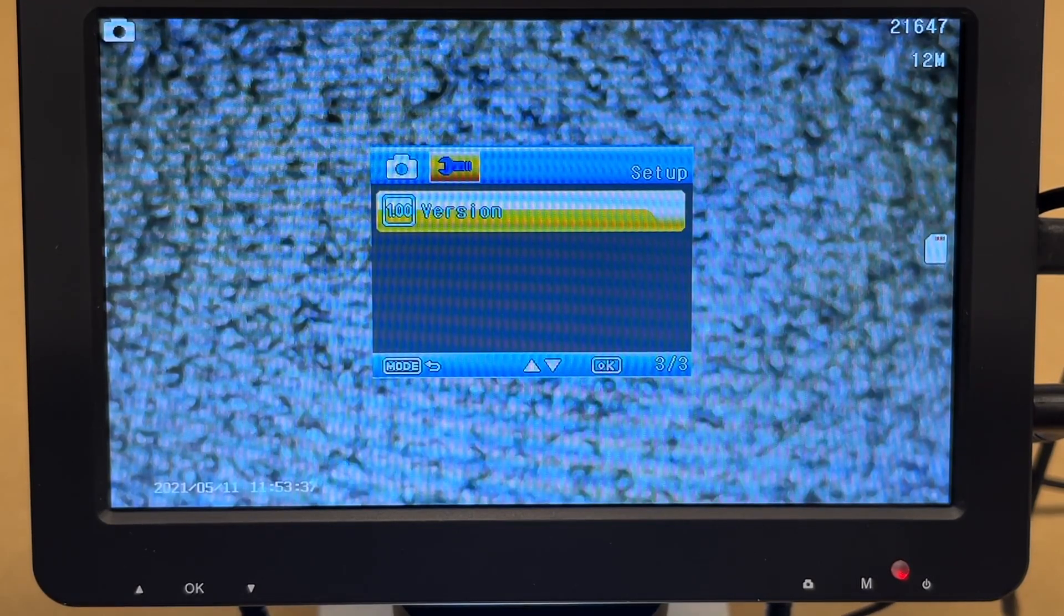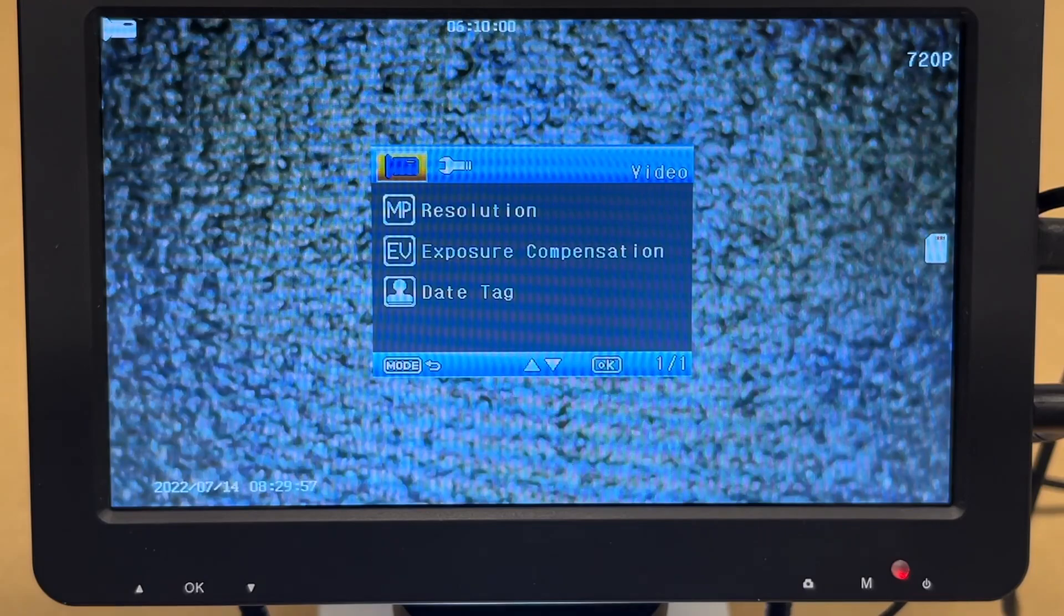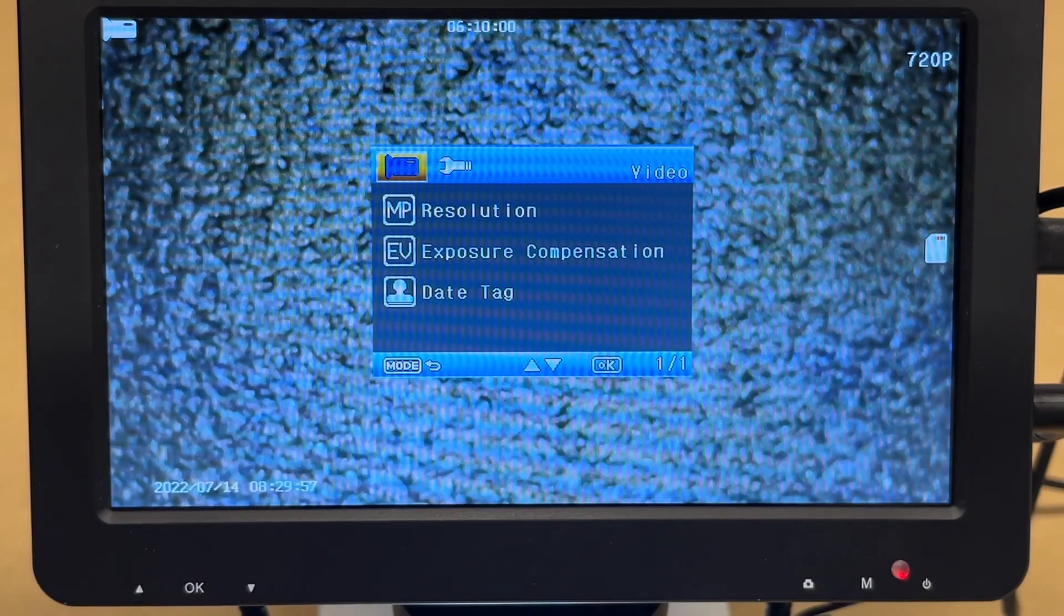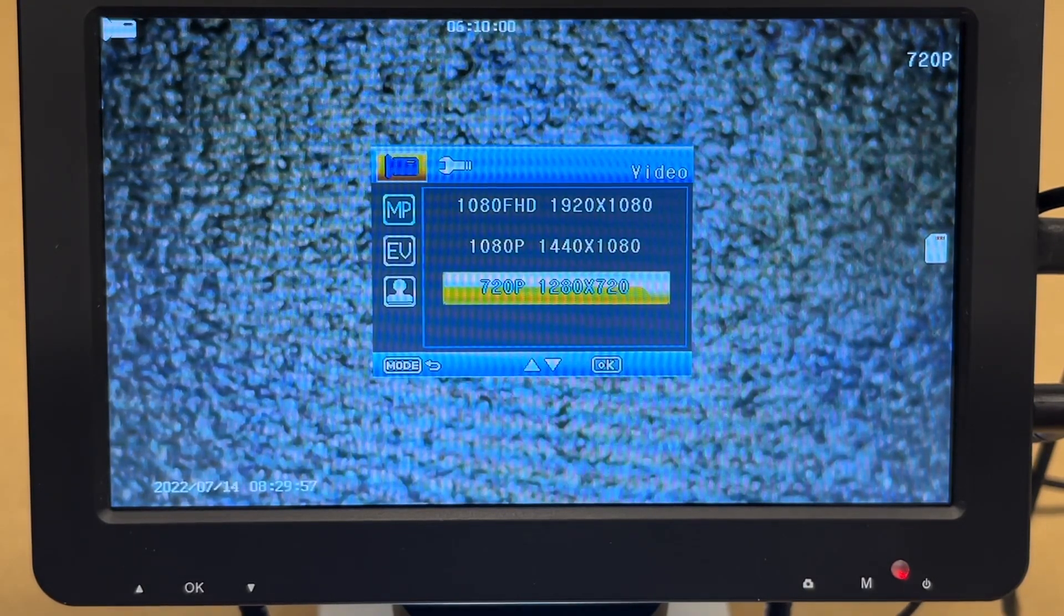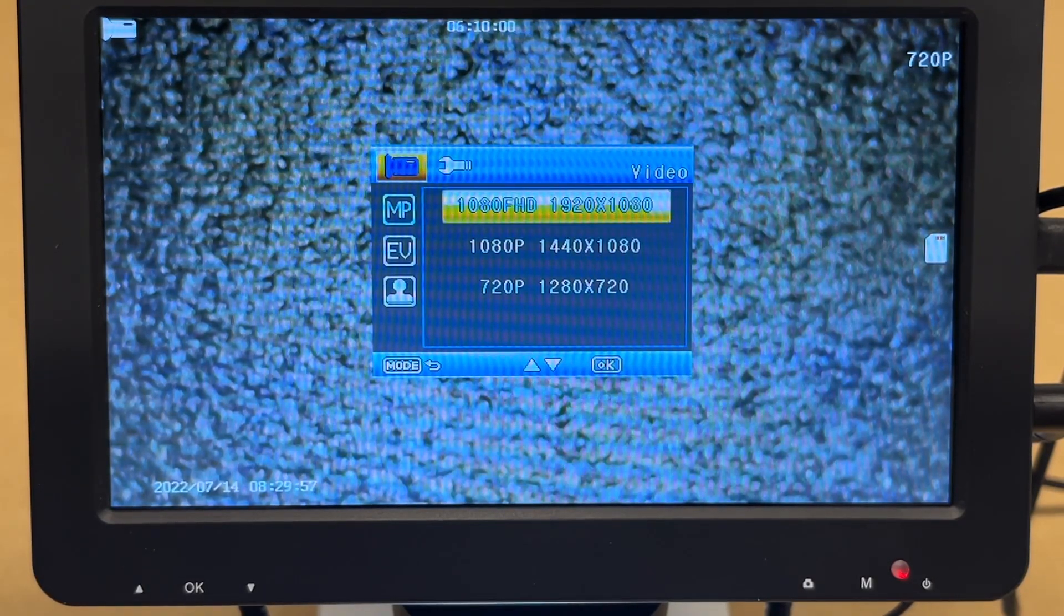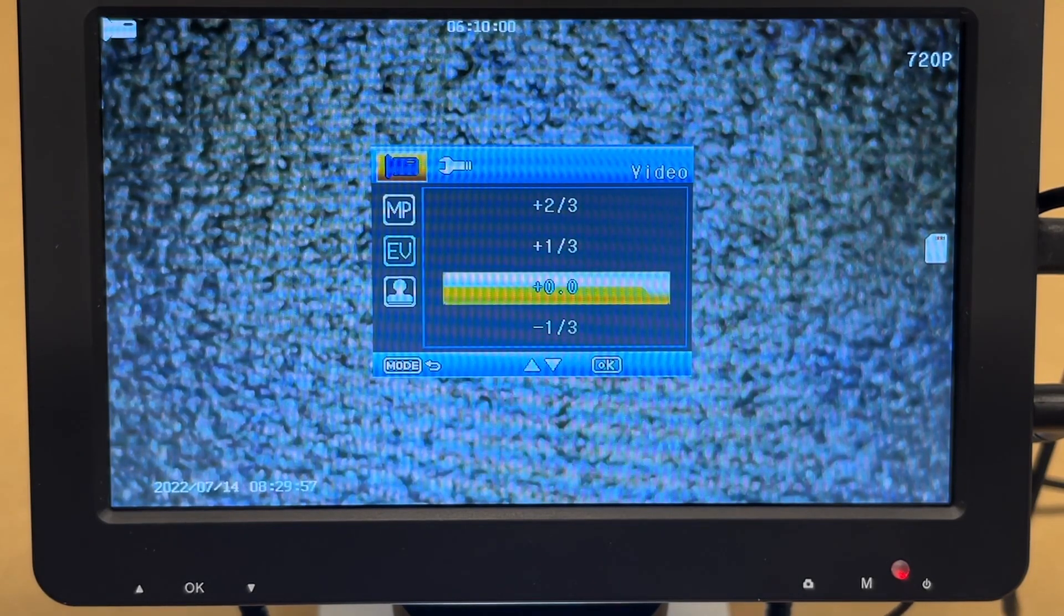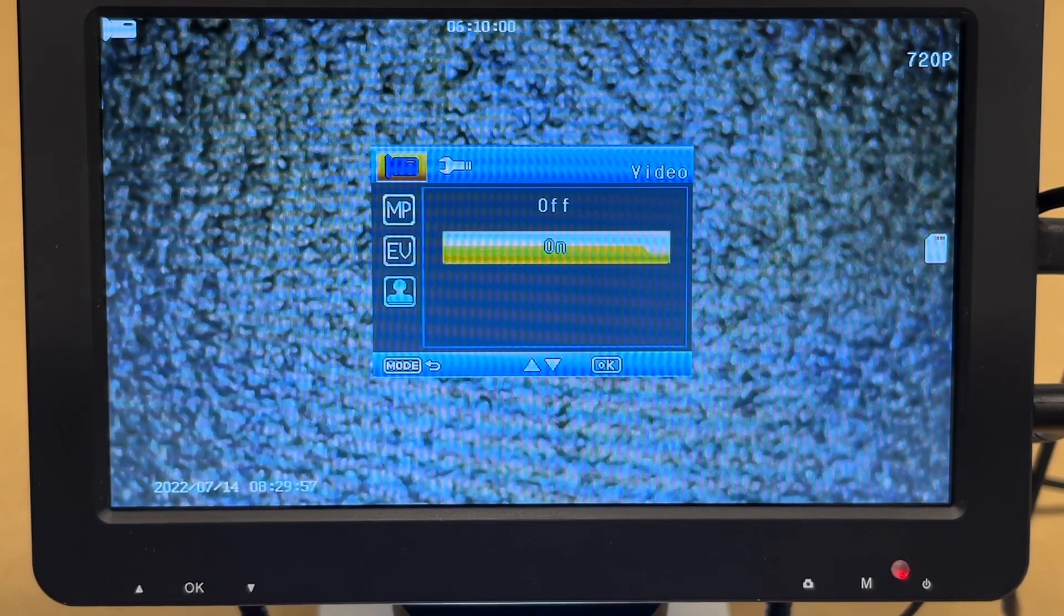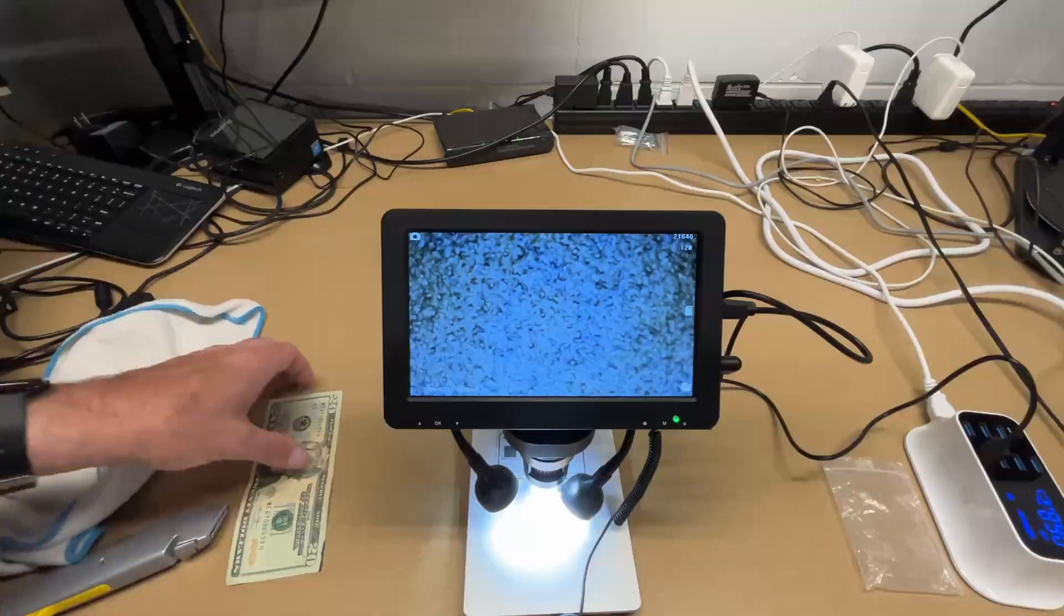So if I hit the little camera icon here, I can go into the video mode. And if I hit the menu button there, we have similar options. So we can go to resolution here. So I'll change it to 1080p FHD. And we have exposure, compensation, and the date tag. Now the other settings are going to be the same.